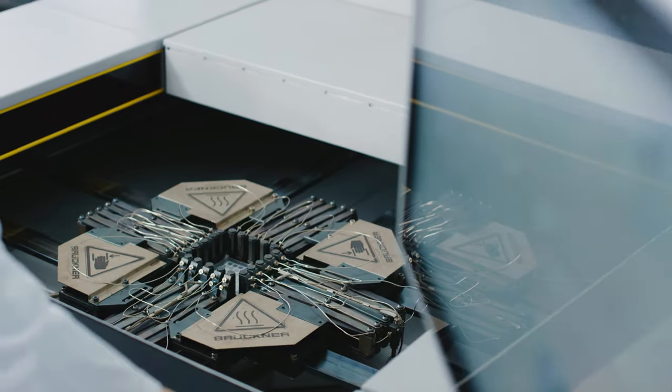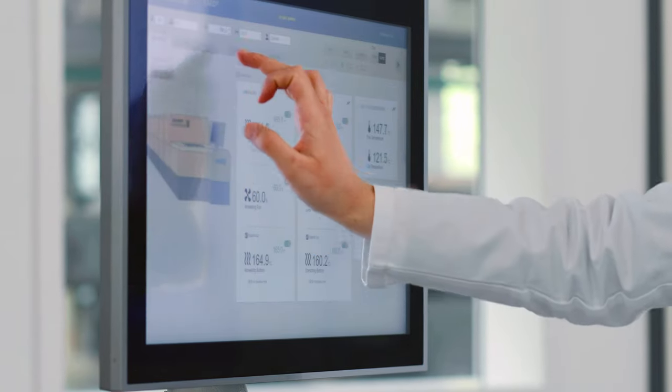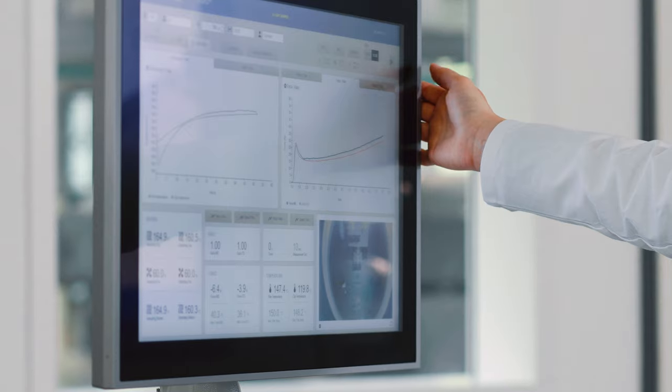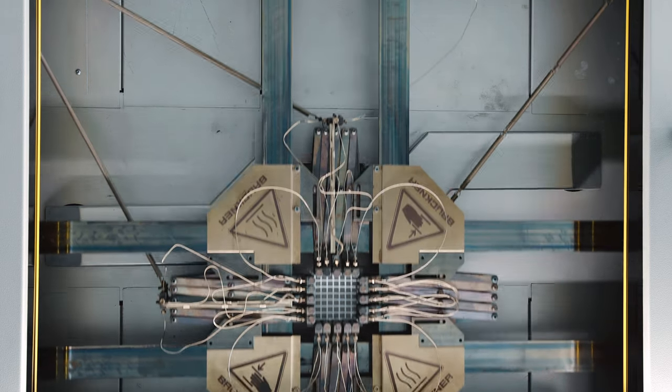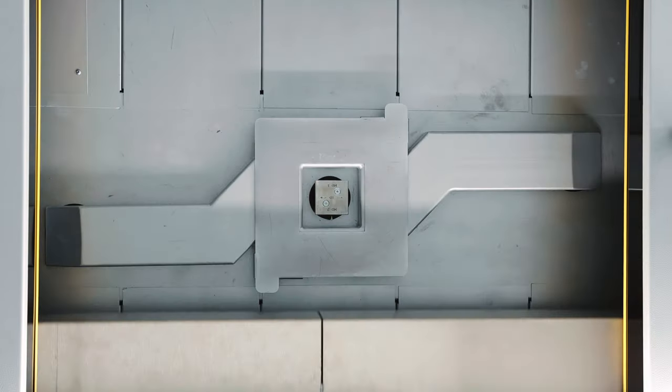And after it has been positioned, the clips can be closed by pressing a button. As you can see, we have added a pattern onto our sample — this will help with the analysis later on. Now that the film is fixed, we will start the procedure, which has been programmed beforehand. After pressing the start button, the tenter will move into the first oven and will be preheated to this temperature. The tenter has already moved into the first oven. As you can see, a diffuser is now moving down to the film. This ensures a fast and efficient heating of the sample.